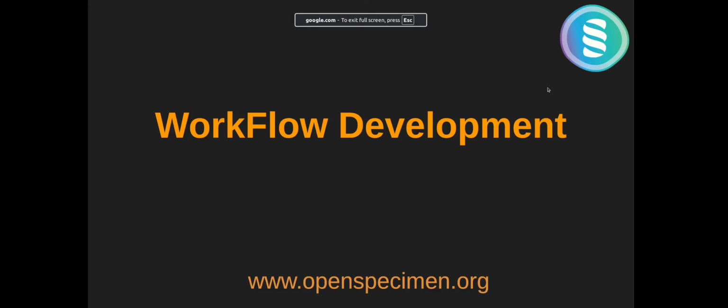Okay, good morning everyone. Myself Saurabh from OpenSpecimen, and today I'm going to show you how to create a workflow from scratch. In the last video we discussed the different components of the workflow, and we are going to use that knowledge in today's demo.